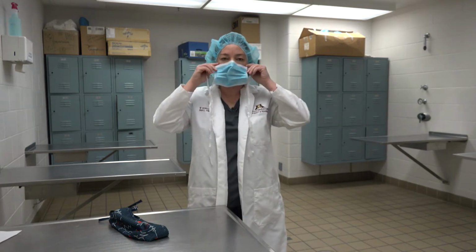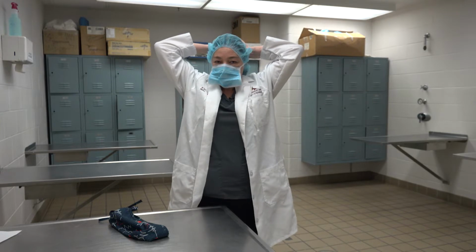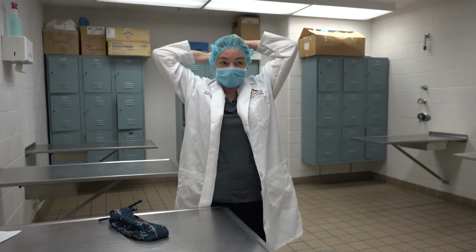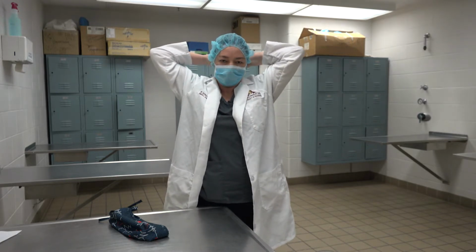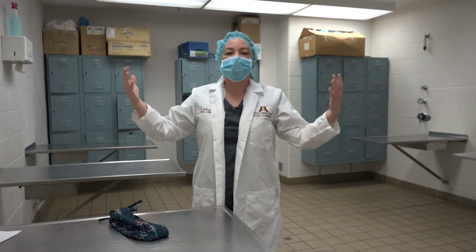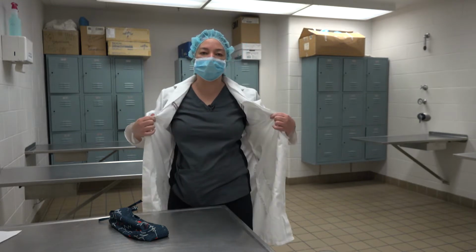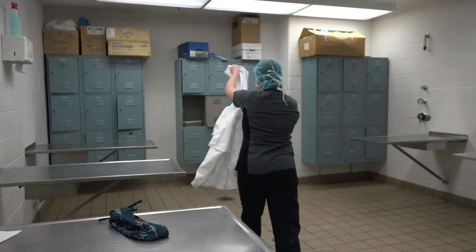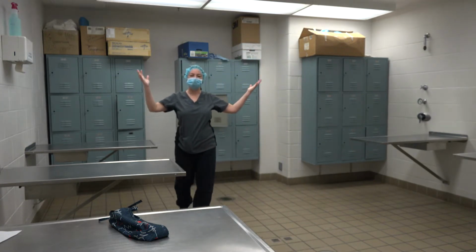Make sure you have your mask also when you go in the surgery suite. For those of you who have beards, technically we should have beard covers. We don't have beard covers in junior surgery, and so we're letting that slide a little bit, but upstairs there will be beard covers for you when you enter 4th year. So now I'm pretty much ready to enter the surgery suite, set all my stuff up, except for I still have my lab coat on. So I'll take my lab coat off, put it in the locker, and we're ready to go.